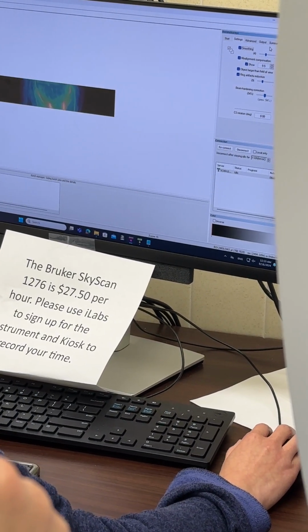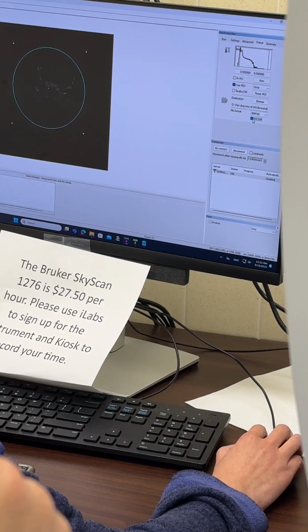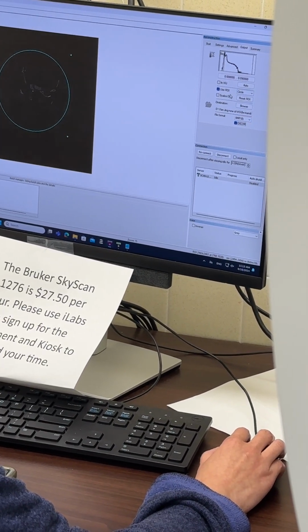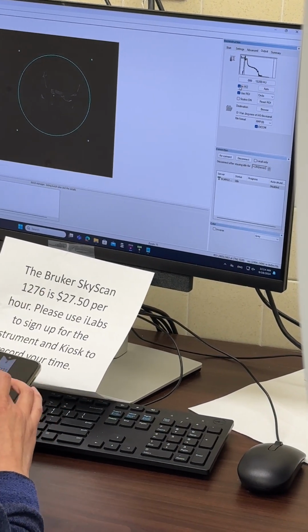Okay, and then we've done it. Go to the check DICOM also. Normally it's been checked. This one also issue. Let me see.